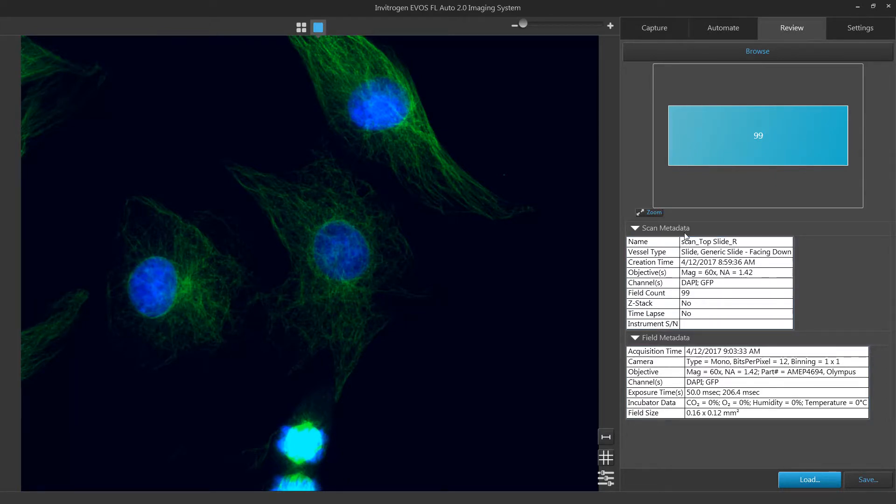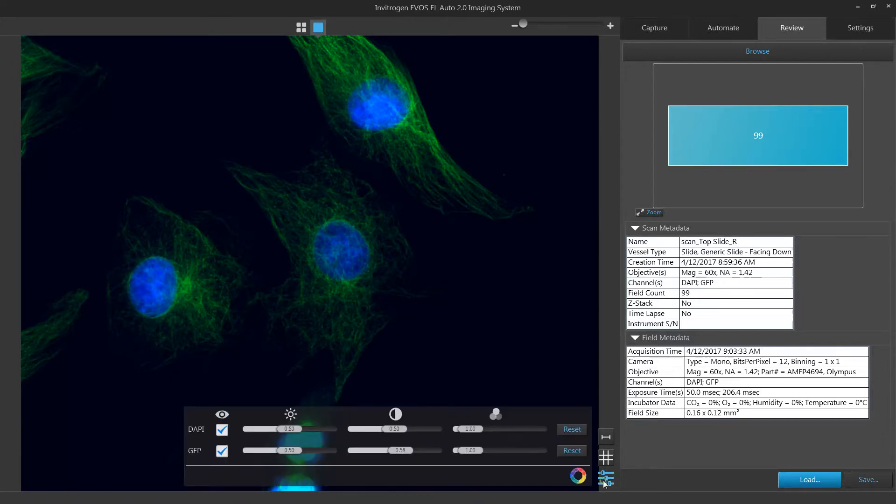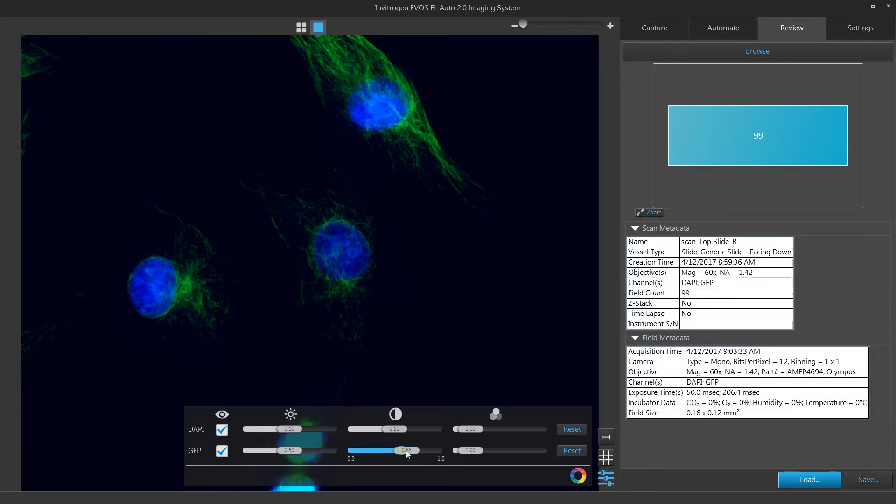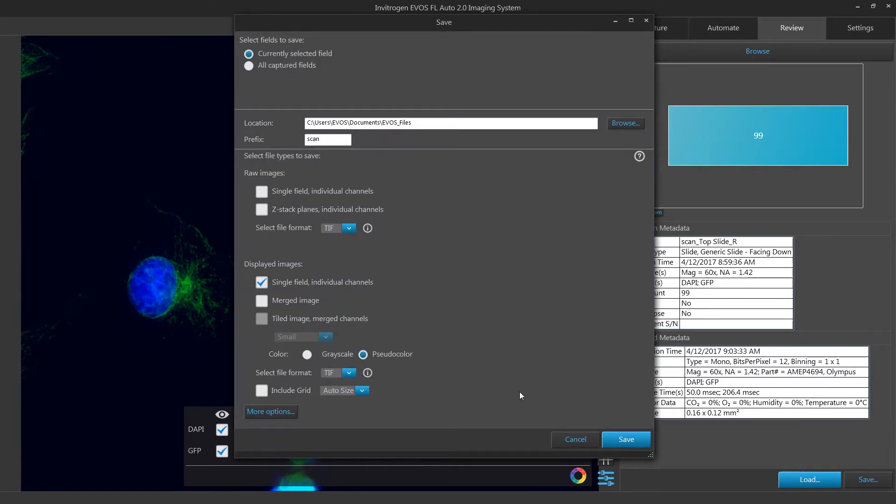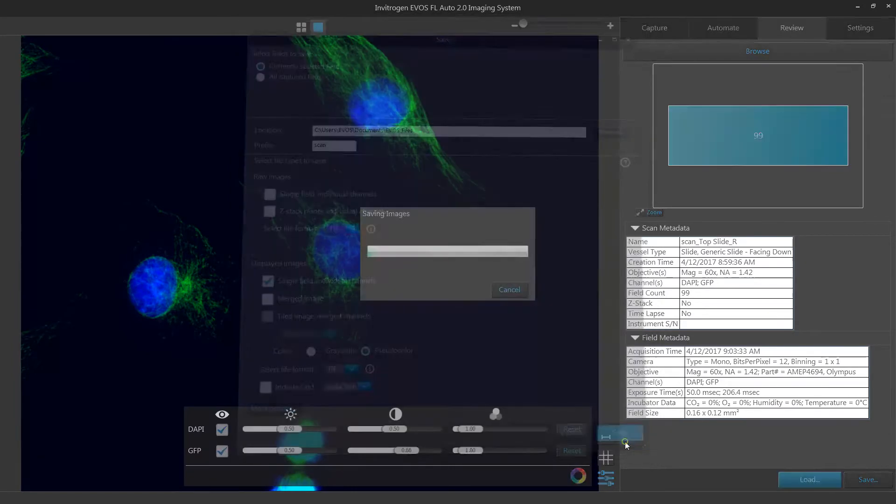If you wish to adjust image brightness, contrast, or gamma, you may do so in the image display settings toggle. Click save if you wish to resave your image with these new display settings.